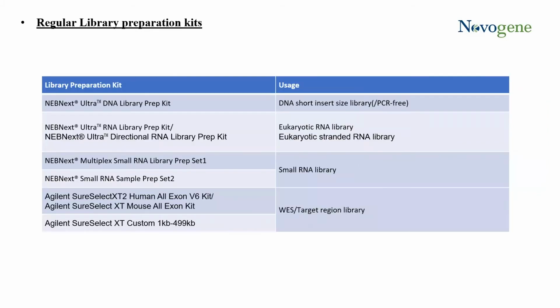All right, and then this, I just wanted to give a brief explanation here, or sorry, shout outs, I guess, if you will, to the commonly used kits that are on the market. These we do see all the time. NEB is a great one. Yeah, so these are just some common library prep kits.